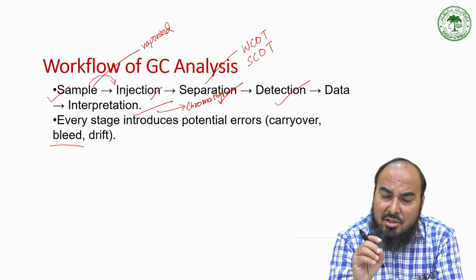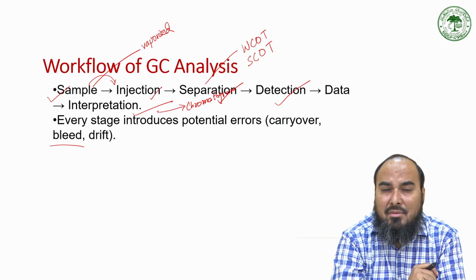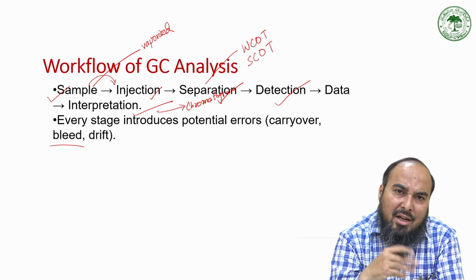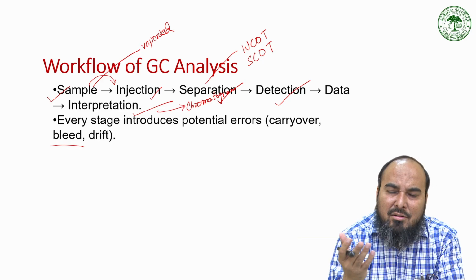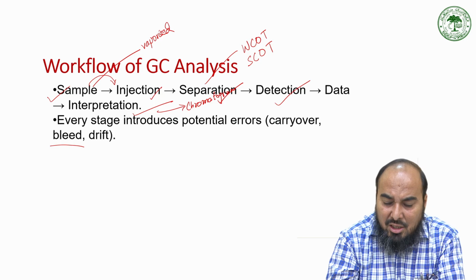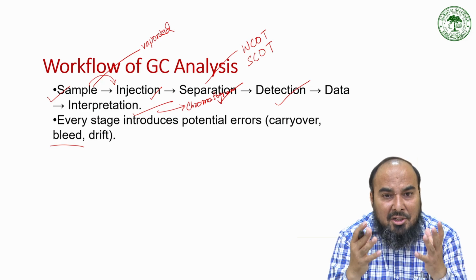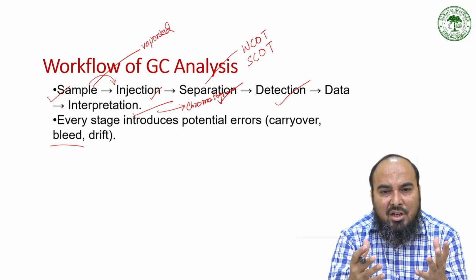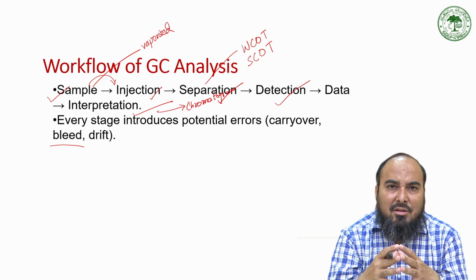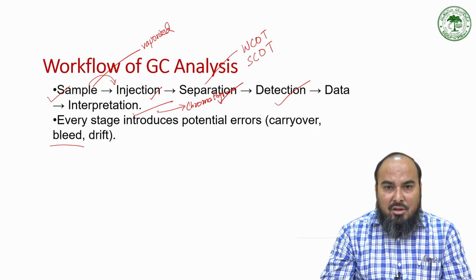So you have to take care of each and every step. Otherwise, you will end up with error and you will be nowhere. You do not get the desired results. Similarly, choosing the proper detector. And then after that, interpretation. So at every stage, there are chances of error and you have to be very cautious at every stage.